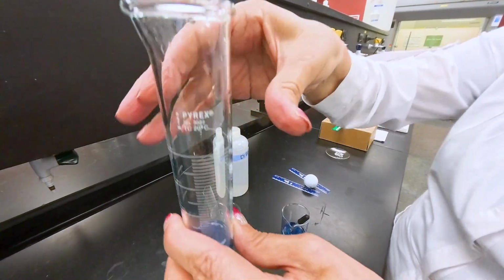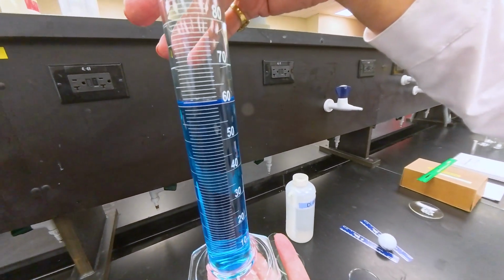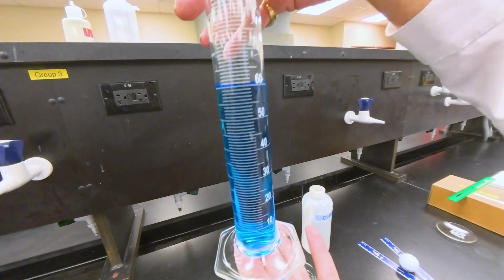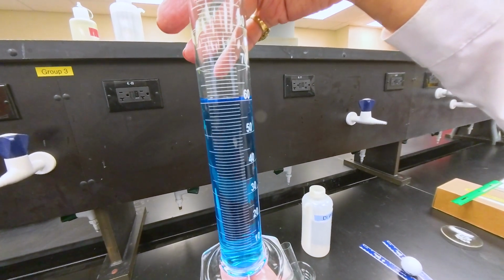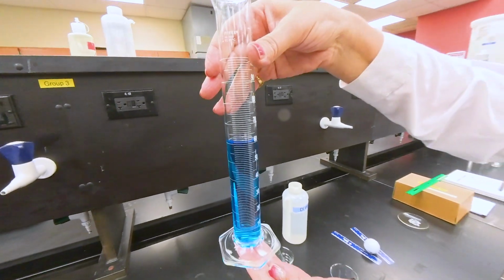We are looking for the meniscus, and it's a number between 60 and 61. Use the still shot to get that number exactly, but that's how we are measuring.